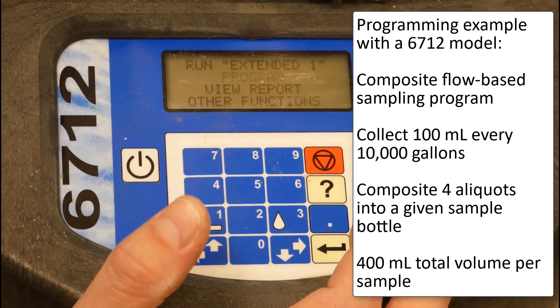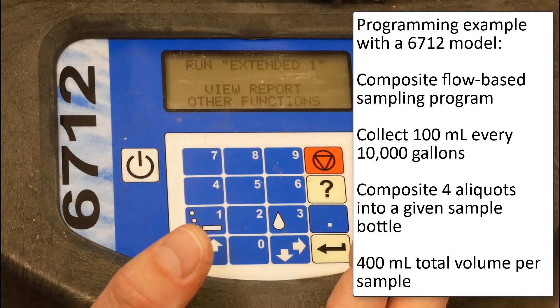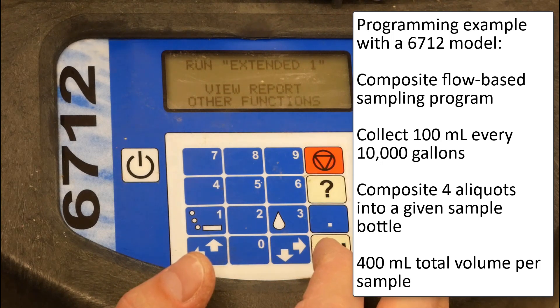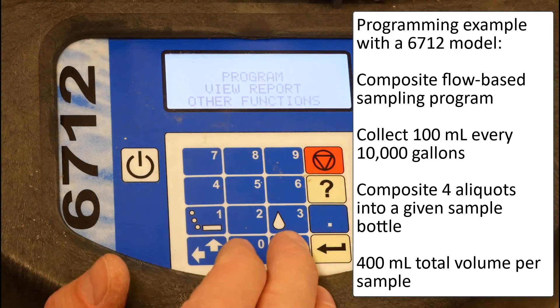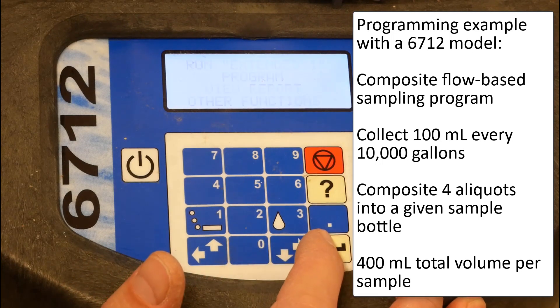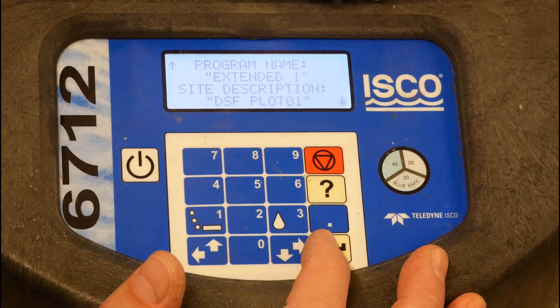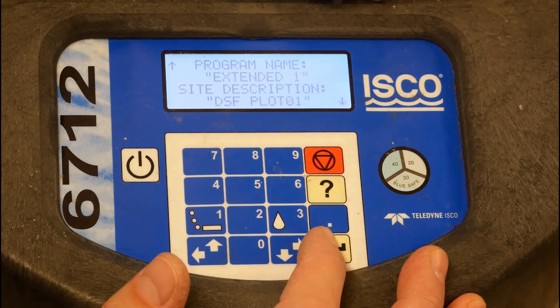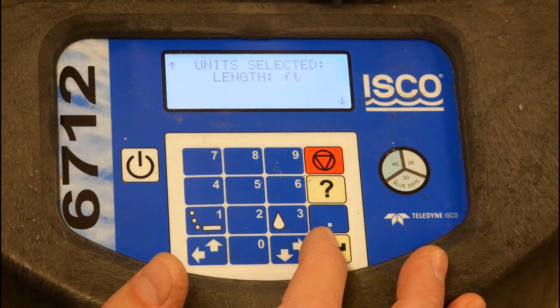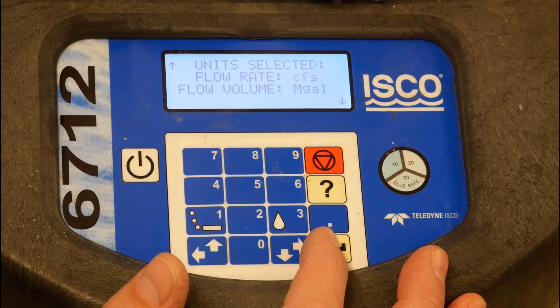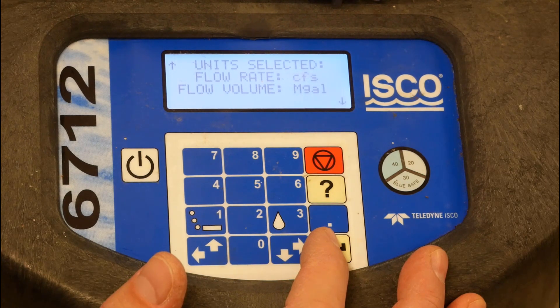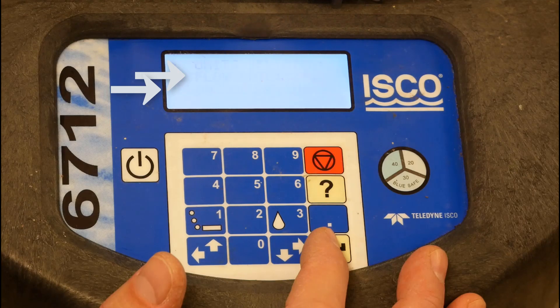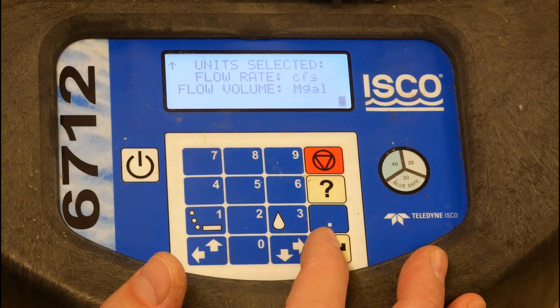Here we're doing an extended program on this ISCO 6712. We'll go to the program option because we're going to program this to do what we want it to do. Here's where we set our program name and site description, and here's where we select our units of measure — English or metric. Here's where we also note what kind of units we want to use for flow. Right now we're set to use cubic feet per second and millions of gallons for flow rate and volume, respectively.